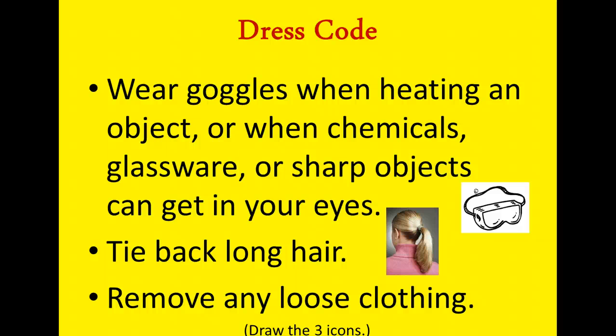Right now it's fairly warm and it's not an issue, but when it gets colder and we start wearing long sleeves and sweaters and hoodies, we need to be able to take those things off so that our sleeves don't get caught in any of the equipment or get caught in a flame.